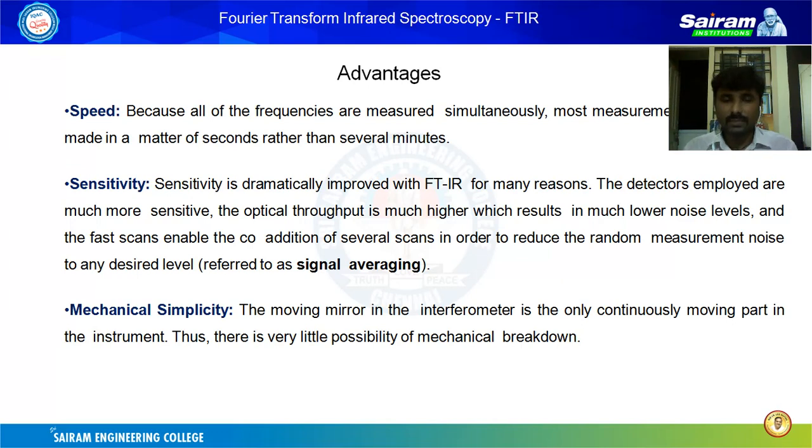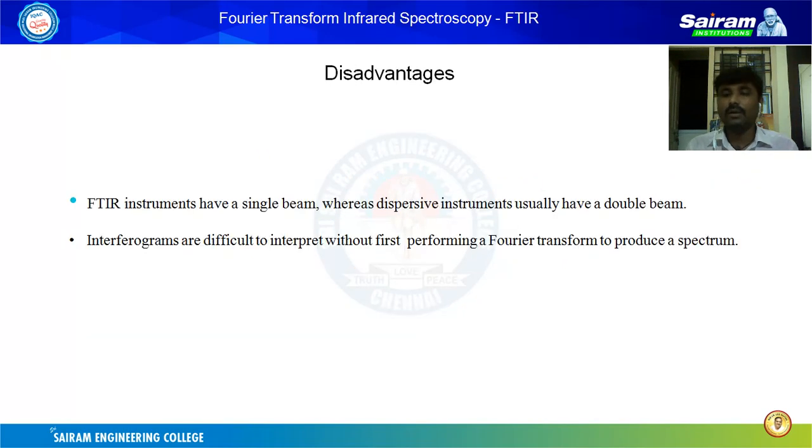Next is mechanical simplicity. The only moving mirror in the interferometer is the only continuously moving part in the instrument. Thus, there is very little possibility of mechanical breakdown.